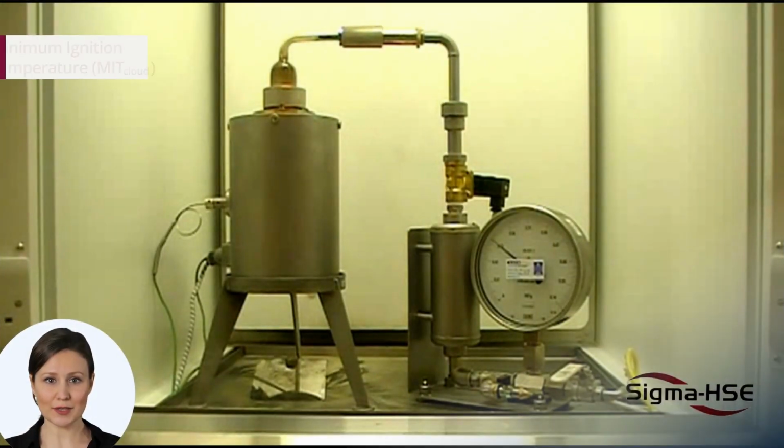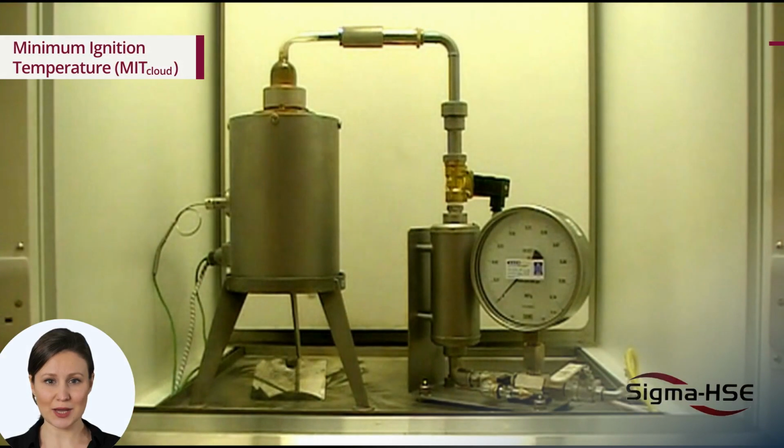Minimum ignition temperature, MIT cloud. The minimum ignition temperature, MIT cloud, test is conducted to determine the lowest temperature at which a hot surface will ignite combustible dust or powders when dispersed in air.